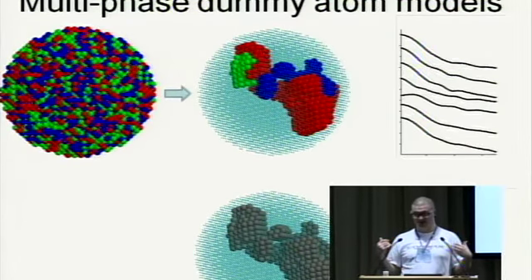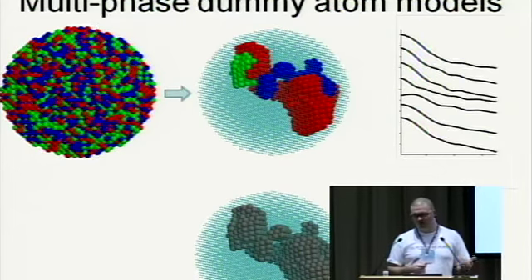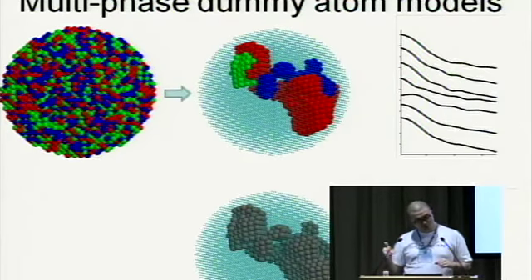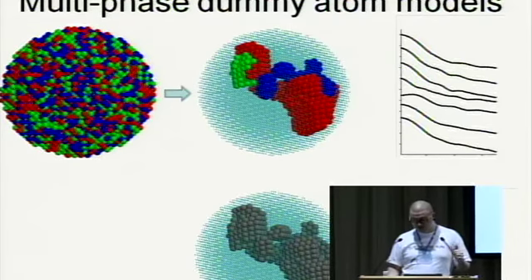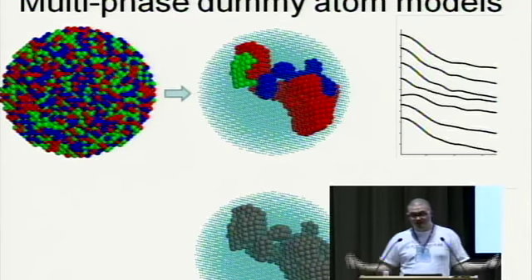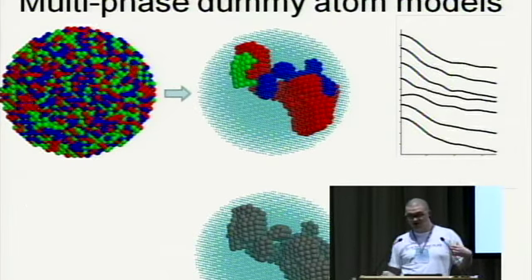Besides, we could collect the data from subcomplexes, where only 2 of the proteins are present. If we assume, and I must say this is a very bold assumption, that the structure of individual proteins does not change alone and in the complex, we could come up with an ab initio model which would show the complex, and individual parts of the complex would fit the data from the individual parts.